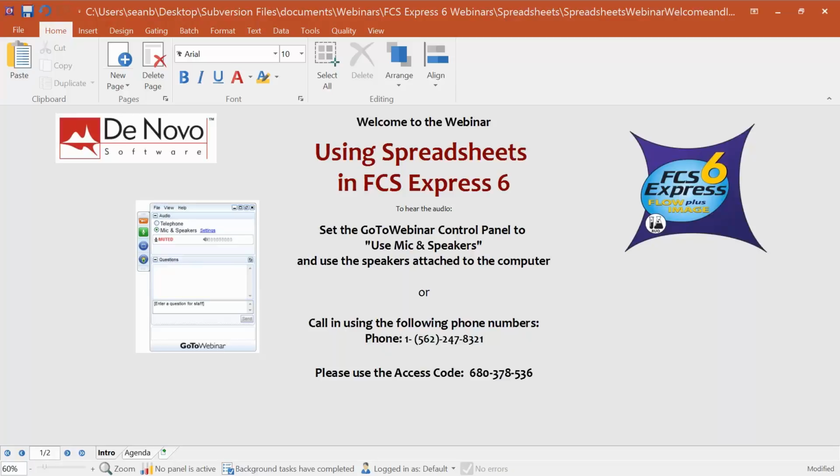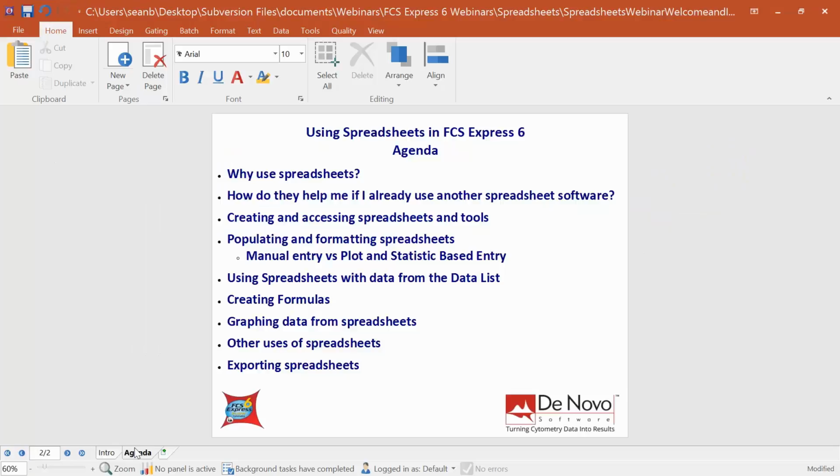There's the ability to integrate Excel-like functionality directly in FCS Express so we can link back and forth from any spreadsheet-derived values to gated data and any FCS files you have. So again, FCS Express now allows you to use Spreadsheets features, access most of the functionality of Microsoft Excel, directly in FCS Express with direct linking to your data, gates, statistics, tokens, and Spreadsheets in FCS Express are going to provide you with all the familiar tools, but while keeping the special needs of a cytometrist in mind.